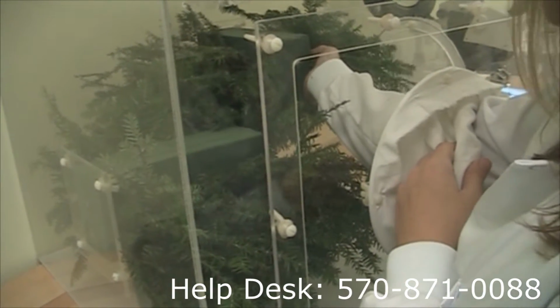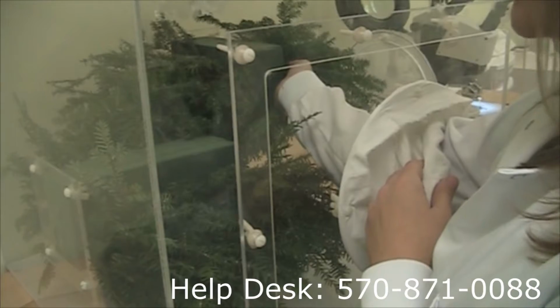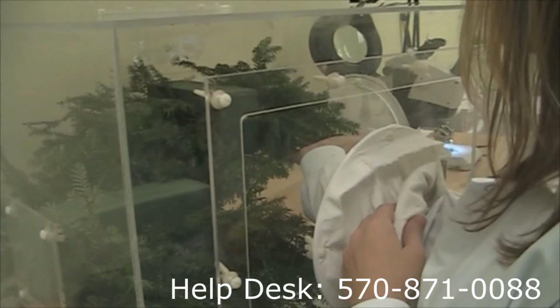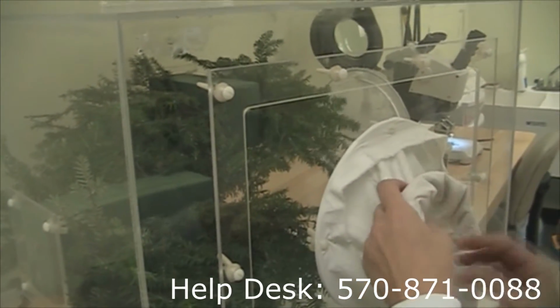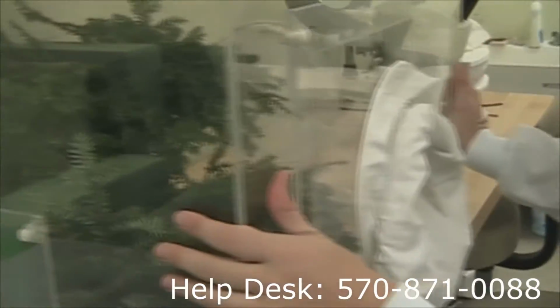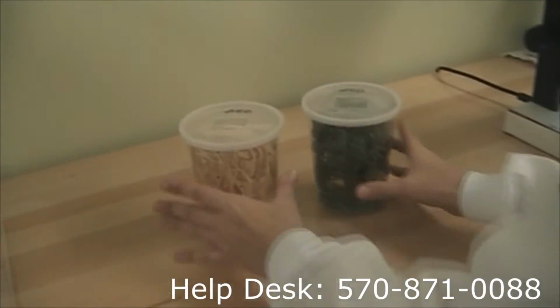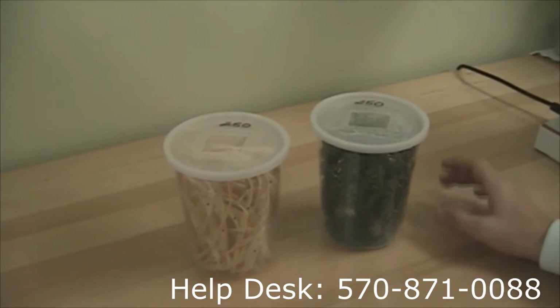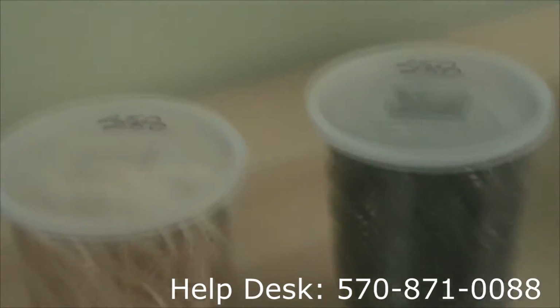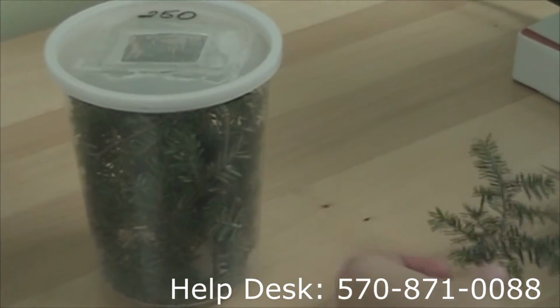At the end of the season, we actually will be taking these out from the tips here, and all of this material here is going to contain every rearing life stage of the Sasajiscymnus tsugae beetle. So those, the ST beetles, we're going to call them for short, are going to be coming out with their eggs, larvae, and pupa that may not have completely developed yet. And one of our shipping practices here is to put them in specially marked containers. In this case, we're actually going to have to take each hemlock branch out of this cage here, and we're going to have to tap them lightly, and all of the beetles are going to come out underneath. And then we're going to hand count them.